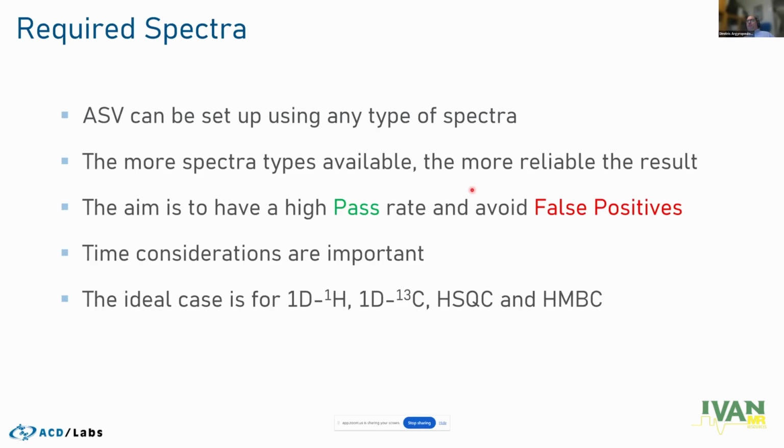It's human nature that we look at the negatives to see why they failed. They wouldn't bother about the pass. So if you have a false positive, this is not good. You need to somehow ensure that you have as few false positives as possible, ideally none. And then you start looking only at the fails and see why they failed, and see if they genuinely failed, if the sample was bad, because it does happen, of course, or the system needs maybe some tuning or a bit more training.